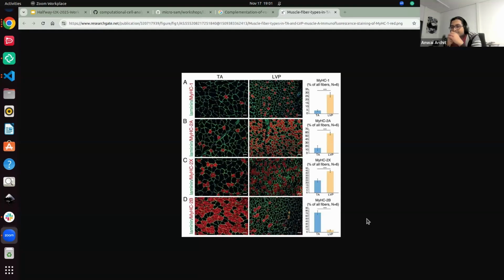Okay. In this case, what I would do is do this in 2 stages because you also have like 4 channels. Totally fine. As long as you are interested in cells, just focus on three important channels which express the membrane or the cell. And this should be enough for you because this is how we make a choice in multiplex images, for example.